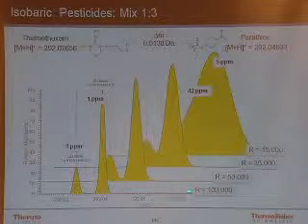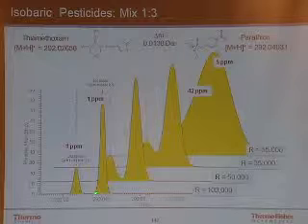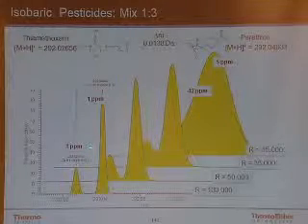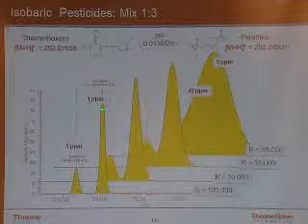Okay, so what you need to do is increase the resolution up to 100,000 to 1, and as the resolution goes up, now you get 2 beautiful peaks, regardless of the concentration, because they're very well separated, and you see that the mass measurement error in that peak is 1 part per million, and in the parathion peak, it's 1 part per million.